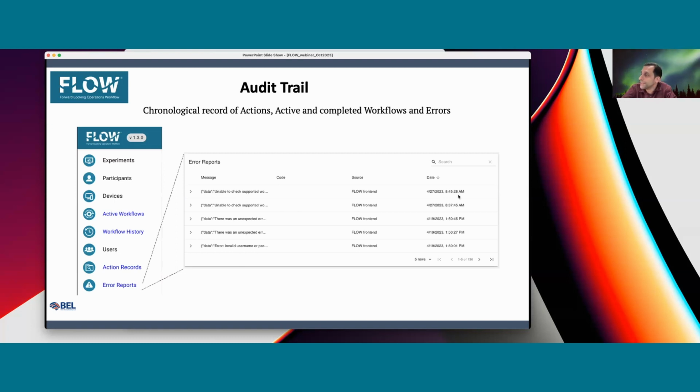And as you can see here, the last error recorded was about 6 months ago. We did not observe any since, but still we cannot exclude the possibility of future errors and bugs. That's where we keep track of these errors. And again, users can extend the tab later and share data with Bell, so for us it will be easier and faster to respond to a specific error.